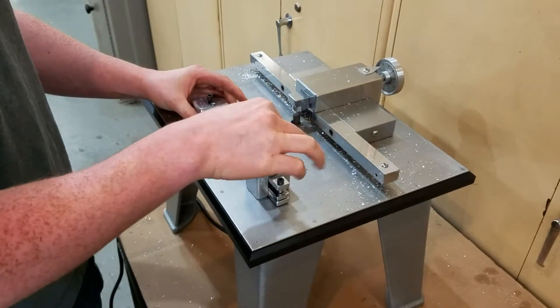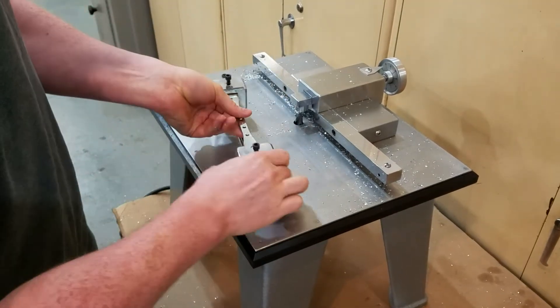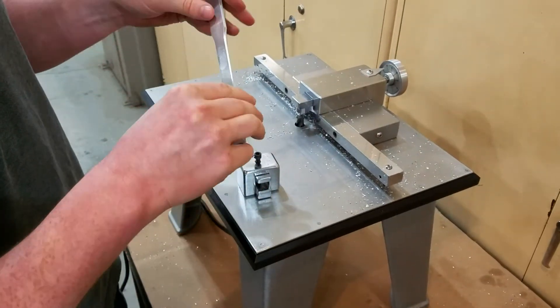And that's actually it. This sample is now all ready to go for your testing. And we have two samples.